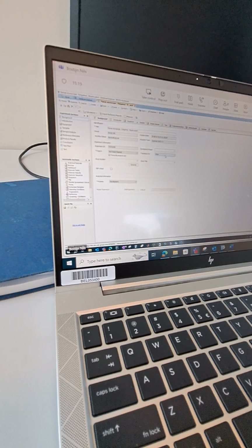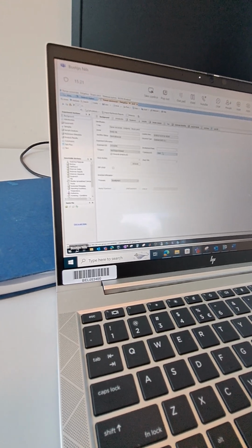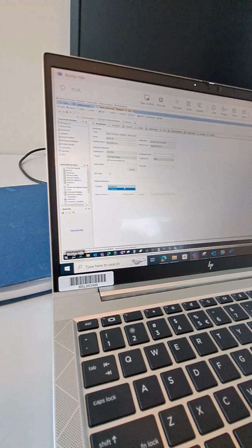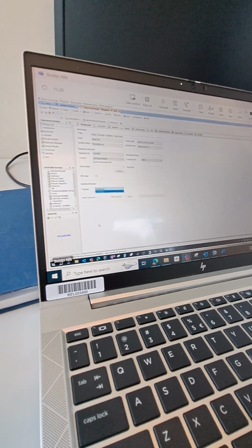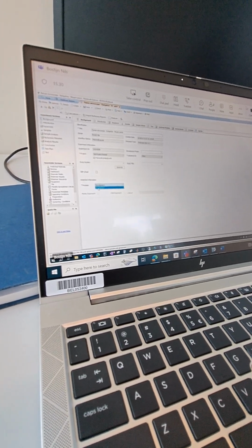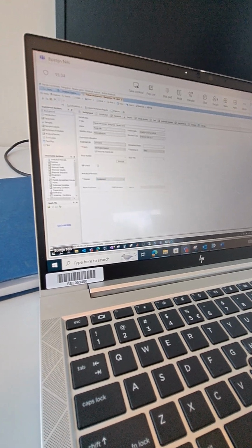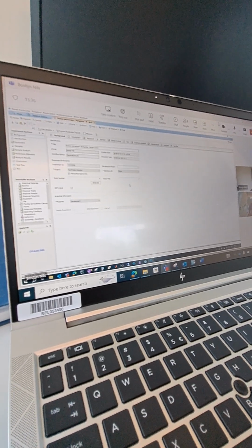Yeah. Fine. For you it can be other, and then the purpose. Normally you have multiple possibilities here, but we can just say development. Fine. Because it's development work. So okay, this is the first tab.